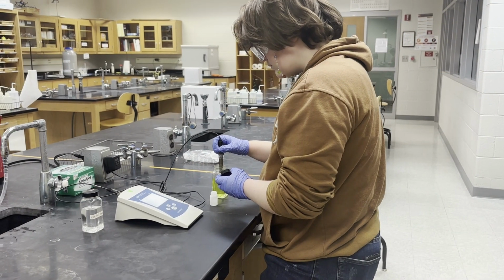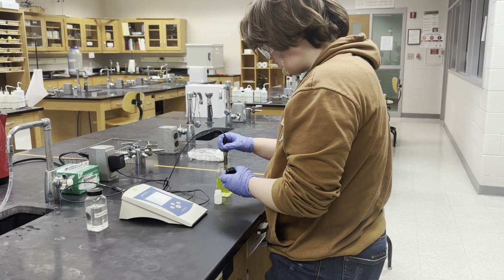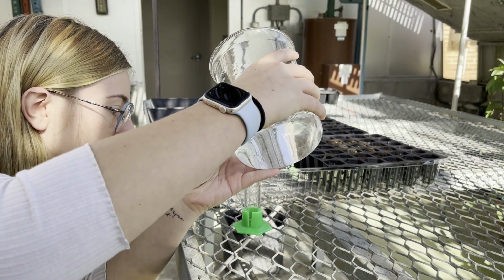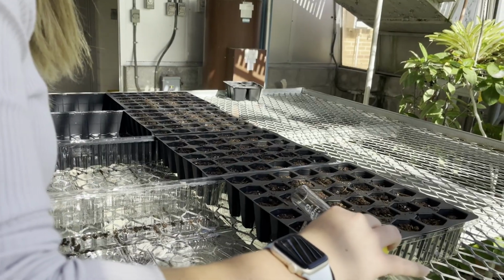We found the specific pHs using a pH probe: 5.5, 4.5, and 3.5 in pH, and then our control would be neutral solutions when we watered. In order to ensure there was data to collect, we waited to start watering with the pH solutions until we had some germination. We watered each plant with 30 milliliters of the assigned solutions.